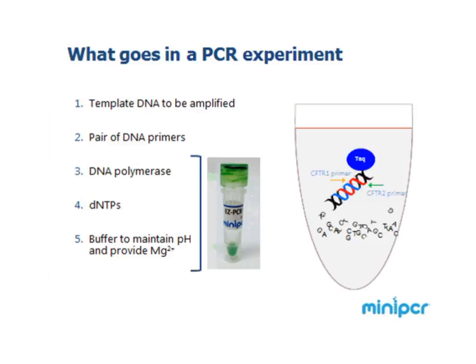So what goes into a PCR experiment? My recommendation is if you don't remember about PCR and why it's relevant, then I would recommend going to the Utah Genetics website or just going into Google and typing in PCR Virtual Lab Utah Genetics, and that should be the very first thing that pops up. Do that first hit and then go through that lab. You are going to do that lab. In fact, I would recommend you do the virtual lab as a refresher. So do that now before you even continue with the rest of this video. Come back if you need to.